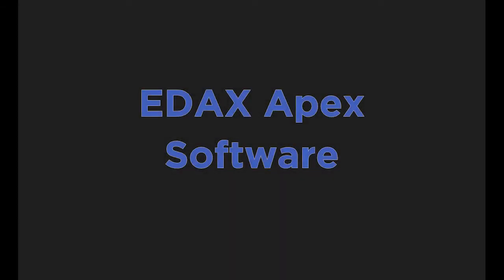Hi everyone, this is Roberto Garcia here at the Analytical Instrumentation Facility, and I'm in the Hydra lab over in EB1. And today I want to show you how to basically do EDS using the EDAX Apex software.